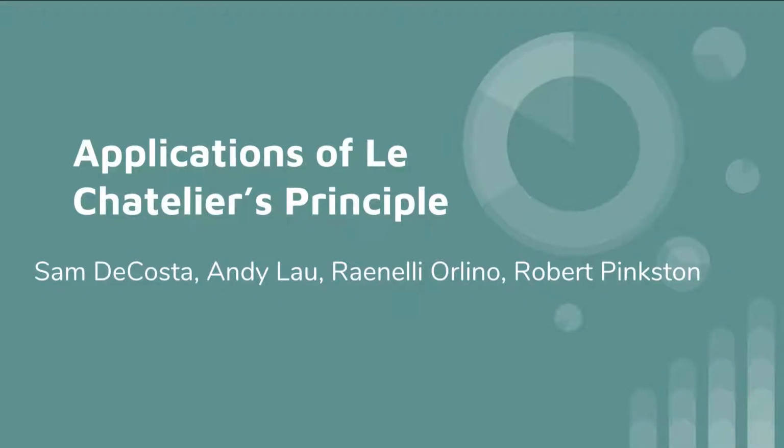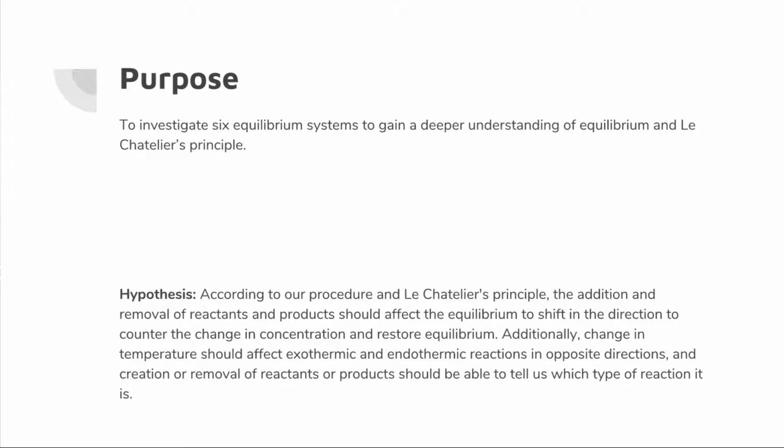Okay, our group will be covering the applications of Le Chatelier's principle with the introductory activity as well as activity B. So the purpose of this activity is to investigate 6 equilibrium systems to gain a deeper understanding of equilibrium and Le Chatelier's principle.